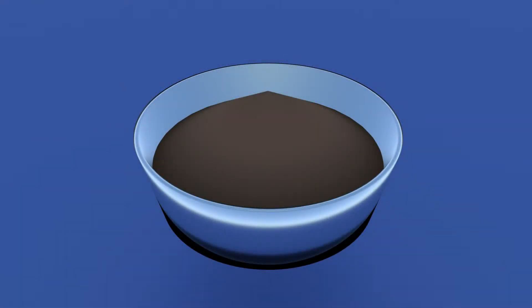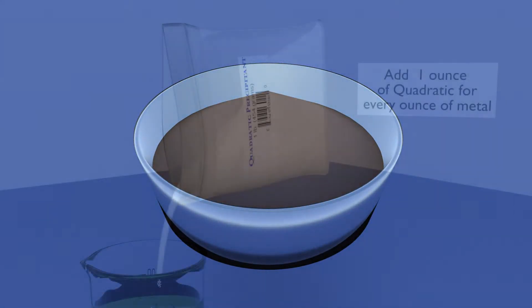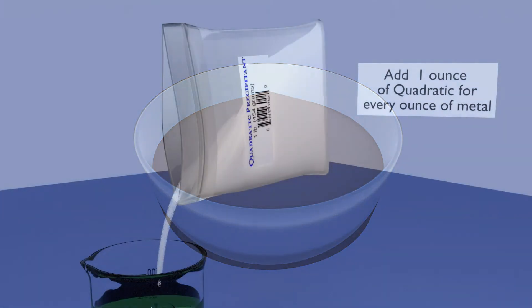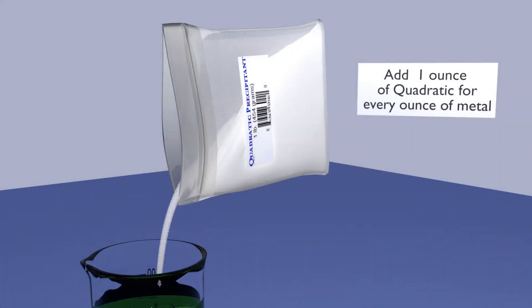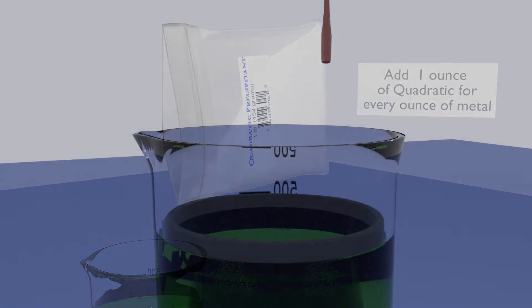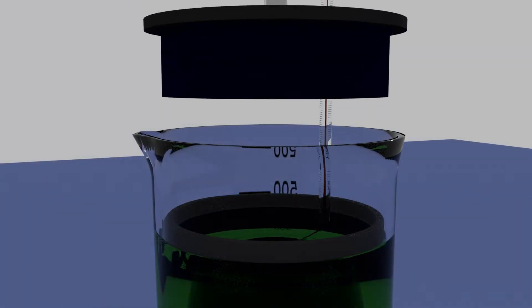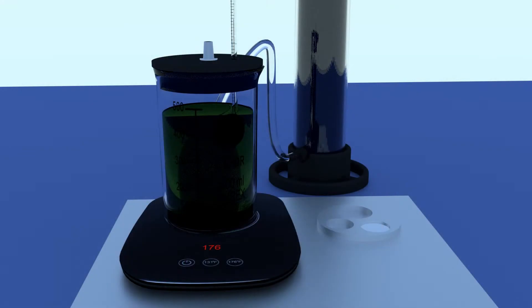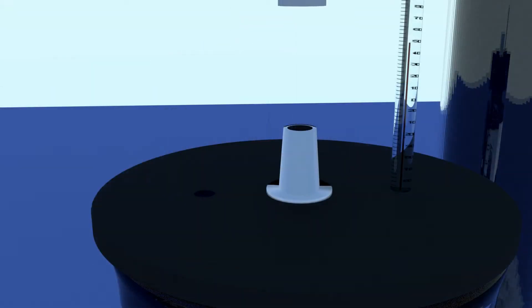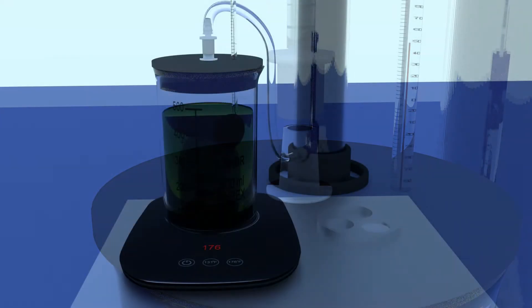We are ready now to convert the dissolved gold into gold particles. Add one ounce of quadratic for every ounce of dissolved metal. Replace the cap and bring the beaker back inside, reconnecting it to the scrubber.